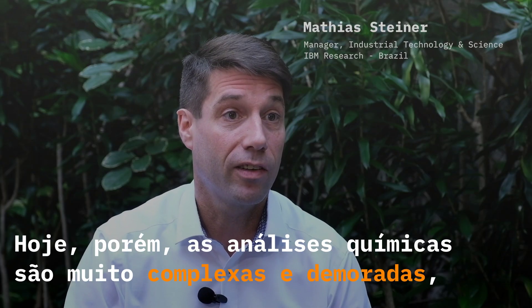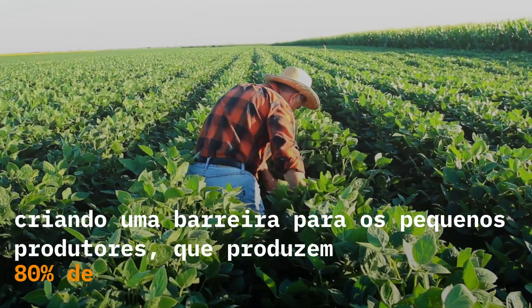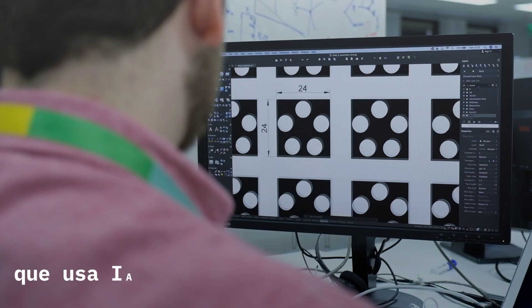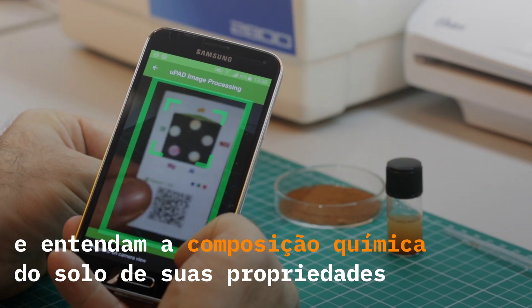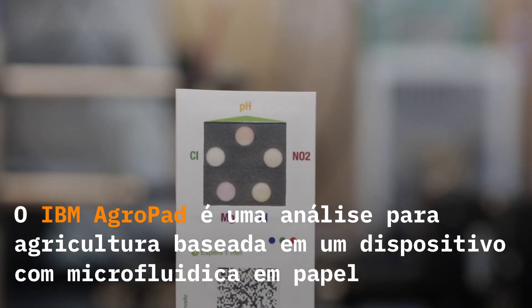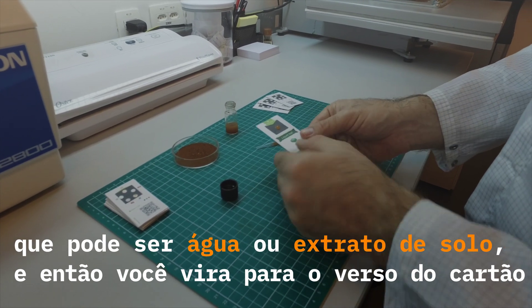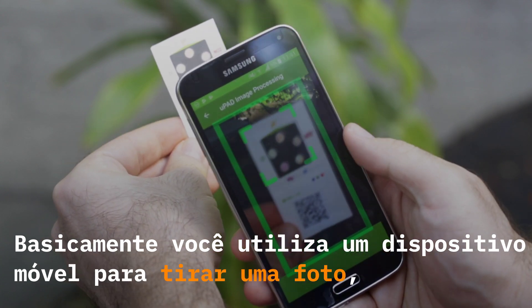Chemical analysis today is very complex and time-consuming. The IBM Agropad is a paper-based analysis tool for agriculture. You deposit a liquid on the card — just a droplet of the sample. It can be water, it can be a soil extract, and then you flip the card around. You essentially use a smartphone application to take a snapshot.